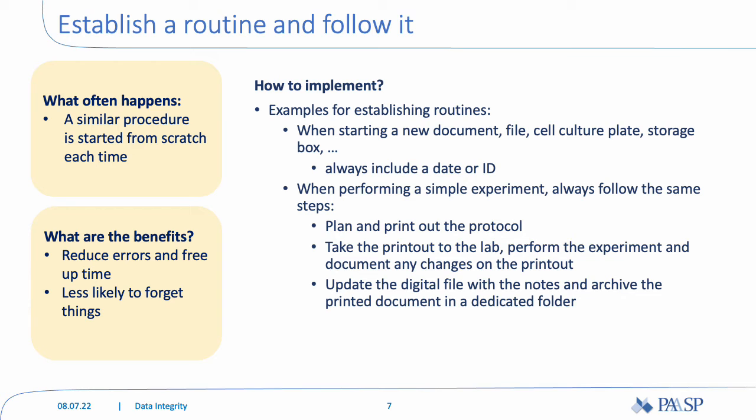an incident happens. Once the experimental part is finished, this document can be taken back to the office and used for updating the lab notebook. Such a routine can ensure that no data is lost.